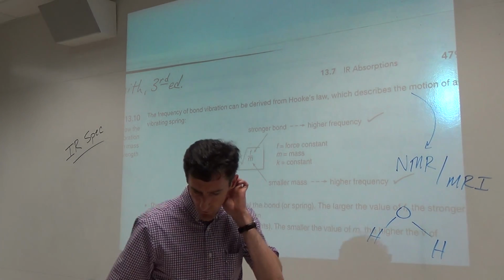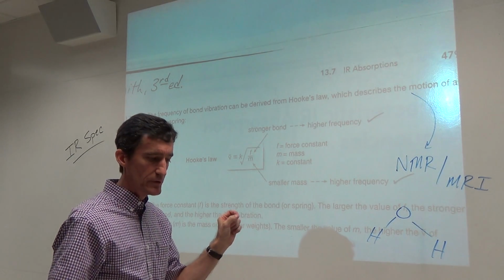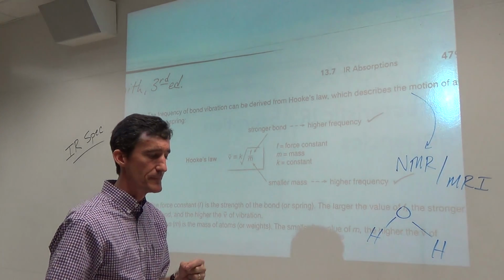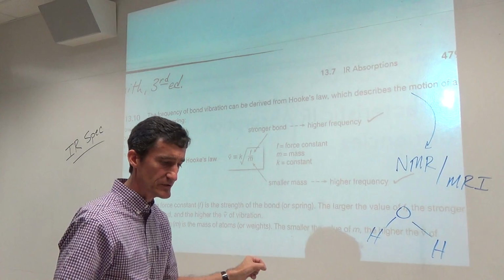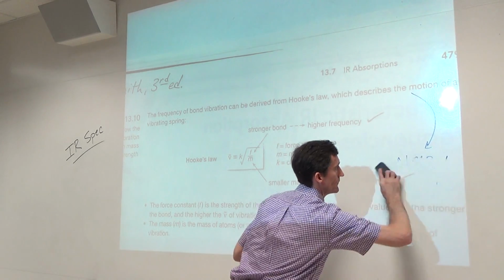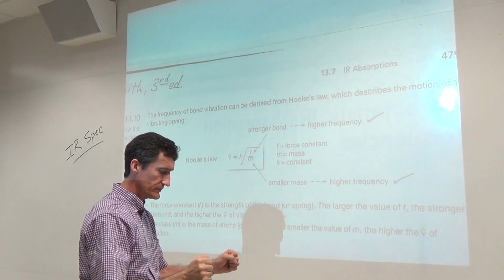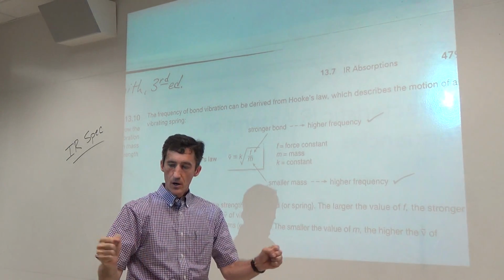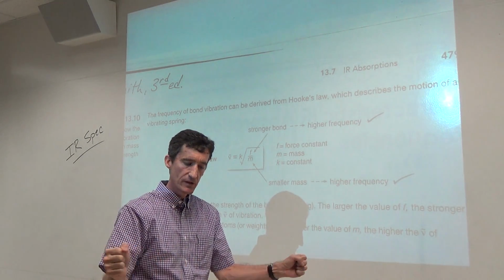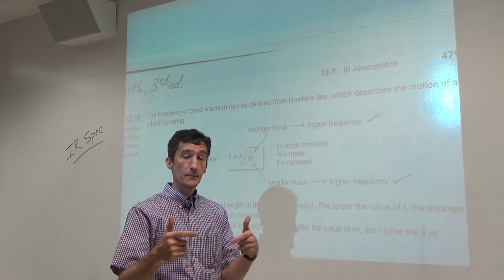Now at this point, let's talk more about how the absorbance takes place. We've said that whenever the incident IR light, that is the light that we're shining on the molecule, whenever that frequency matches a vibrational frequency, you'll get an absorbance. So let's consider we've got a bond stretching, minding its own business. We shine some IR light on the bond. What happens? The bond goes from this sort of standard stretching frequency. The light comes in and absorbance takes place.